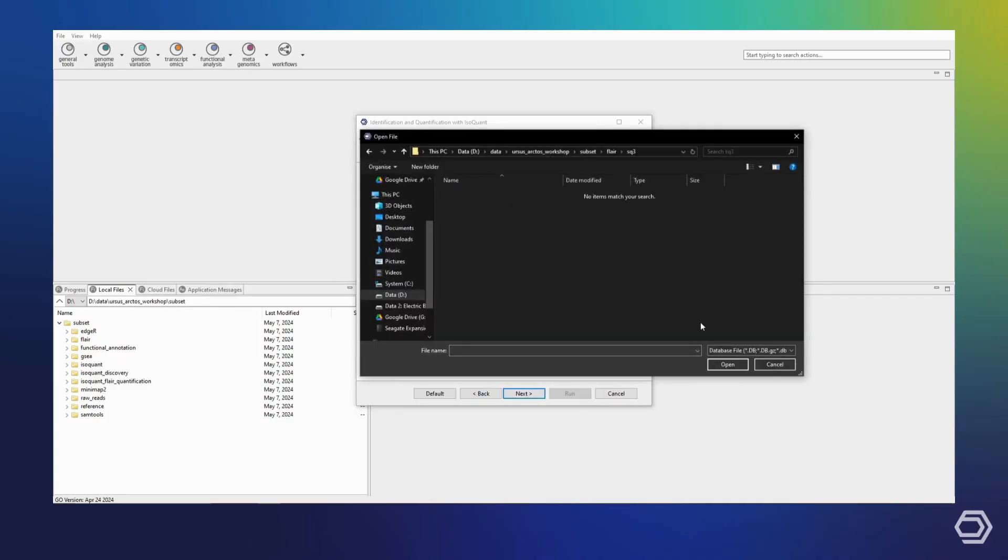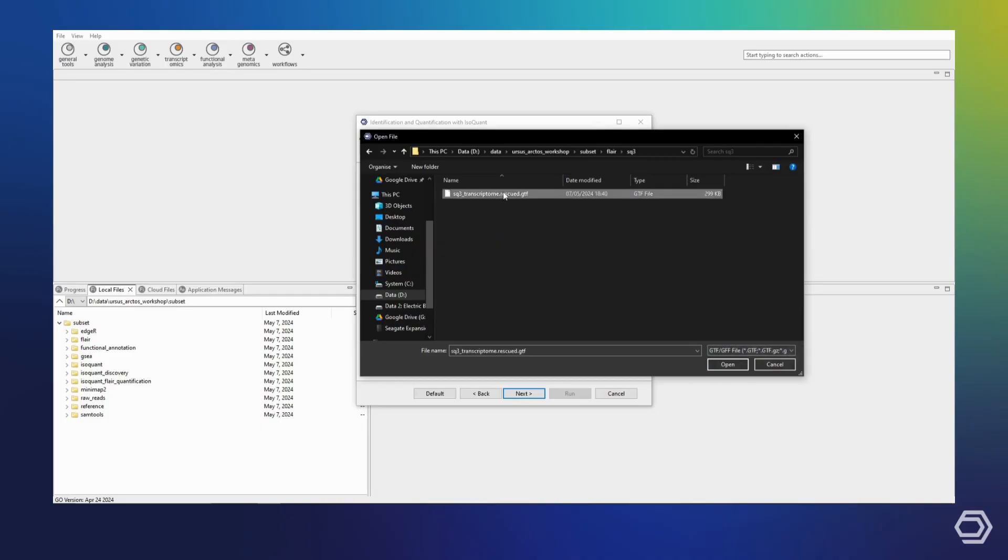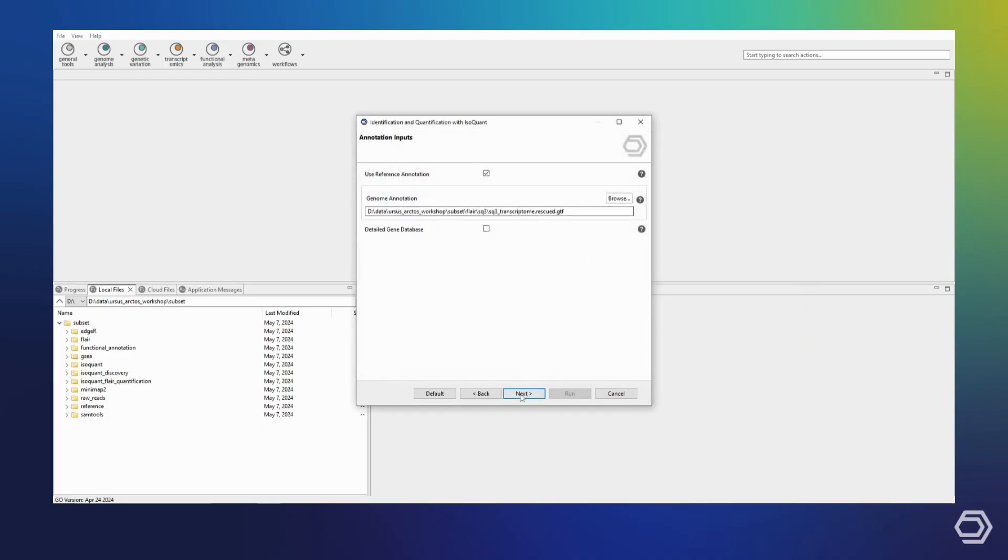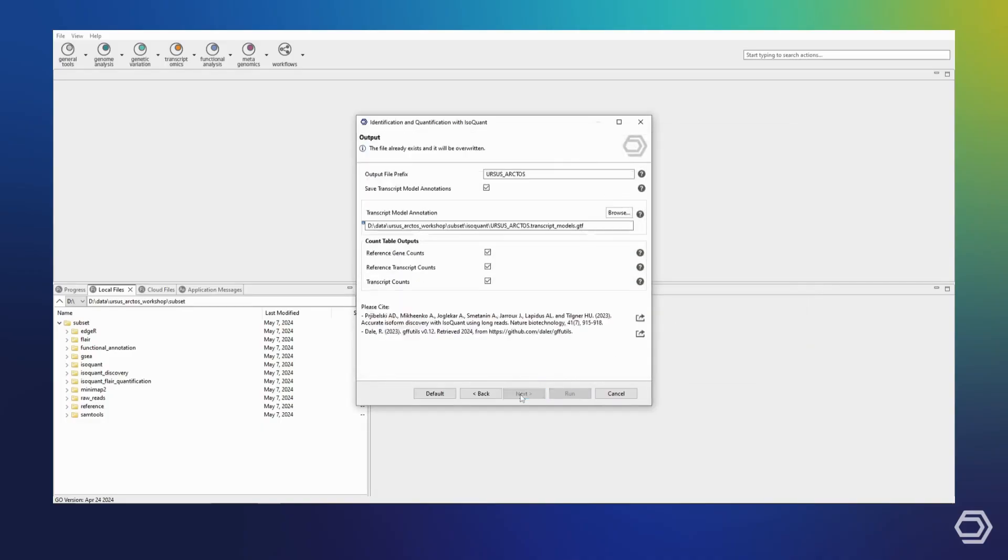Skipping ahead to the output options, we will once again provide a different prefix, but since we are not interested in novel isoforms as defined by IsoQuant, we will disable the output options of the transcript annotations as well as the transcript counts. So, we will only leave the reference quantification options enabled.